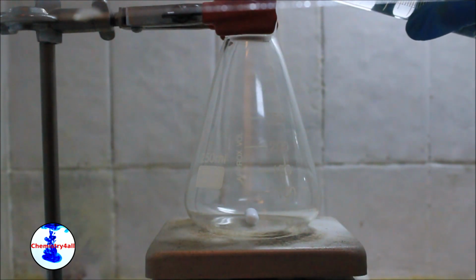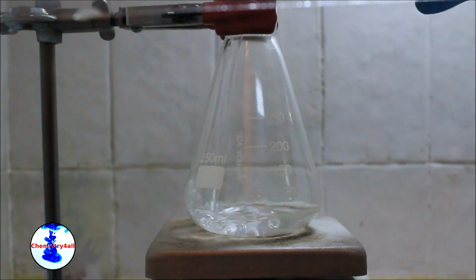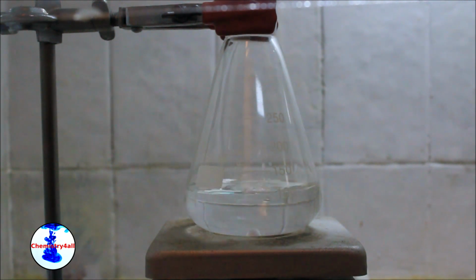First, the ethanol is placed in a clean and dry Erlenmeyer flask. Since water is produced as a byproduct in this reaction, the use of dry ethanol would be highly convenient. However, regular ethanol will also work.